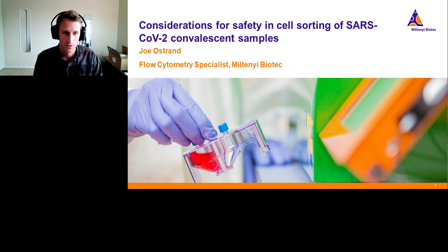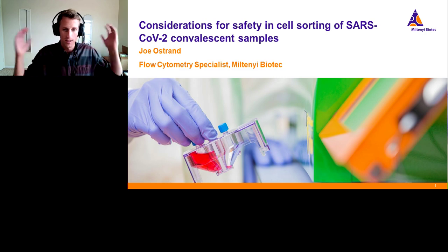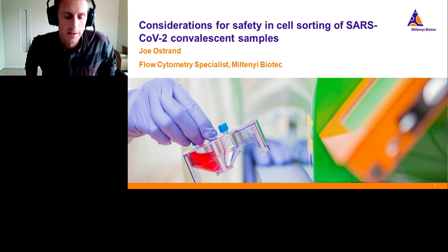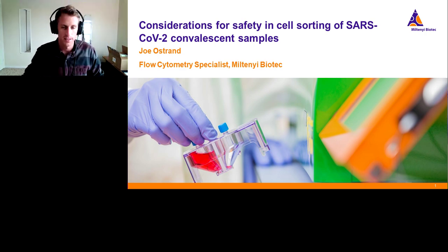And after my PhD, I came to Miltenyi and have since learned a lot about where cell sorting fits in the grand scheme of the science community, and have had the opportunity to work with a lot of experts in a variety of different fields. Today, we're going to focus mostly on the biohazardous element and that arena of cell sorting. And I think that's particularly applicable to the COVID-19 landscape.